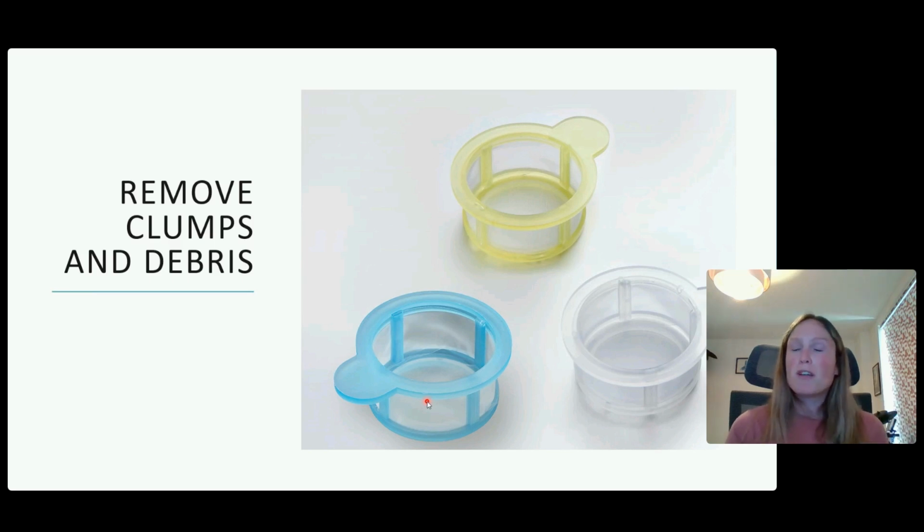And if you're working with a tissue like spleen, you can skip the mechanical and the enzymatic, and just mush it through the cell strainer. It's very easy to work with. Something like colon is very difficult to work with. It's very hard to get a viable single cell suspension from colon.